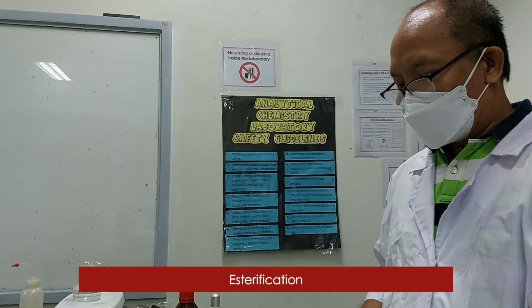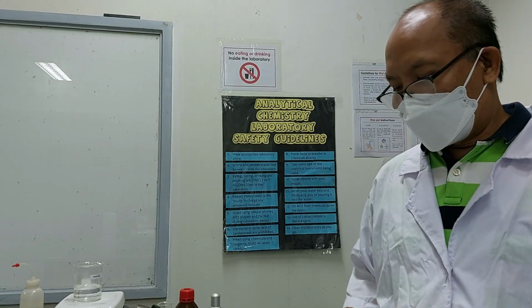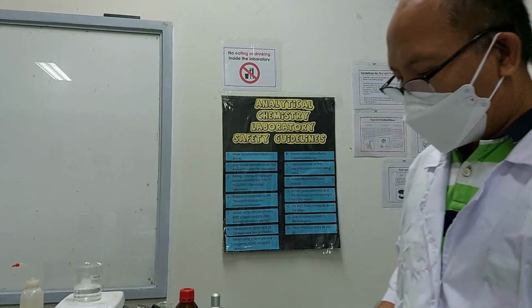Okay, and you know esters are produced from the reaction of alcohol and carboxylic acid, resulting in the formation of a pleasant smell. The smell from flowers and fruits are esters. That's why they are extracted as components for perfume. So how is this done?